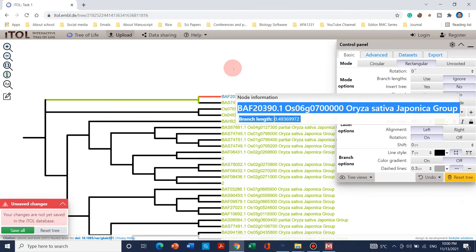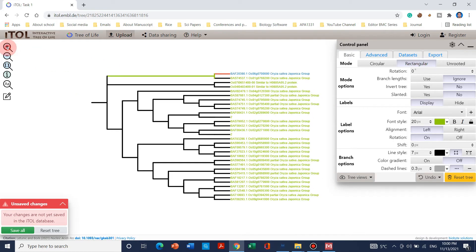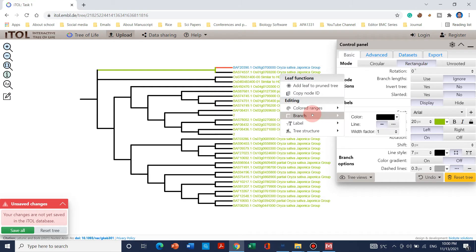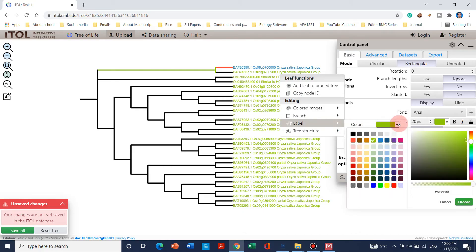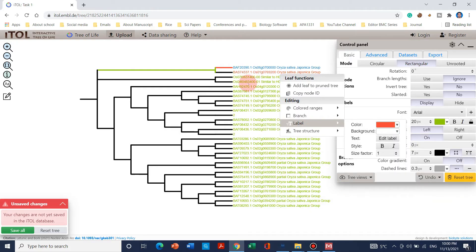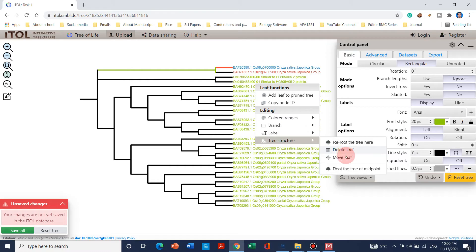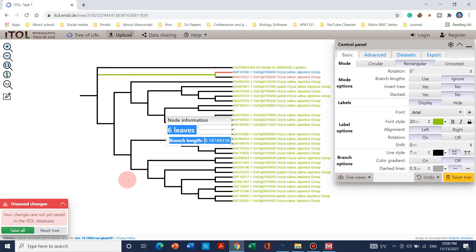You can simply use mouse click to zoom in, or use the zoom in/out option. To change the branch color, you can use that option, and to change the label color you can select, for example, red. If you want to delete a leaf, simply go and delete it — this is called a simple leaf. It's up to you how you want to change this.